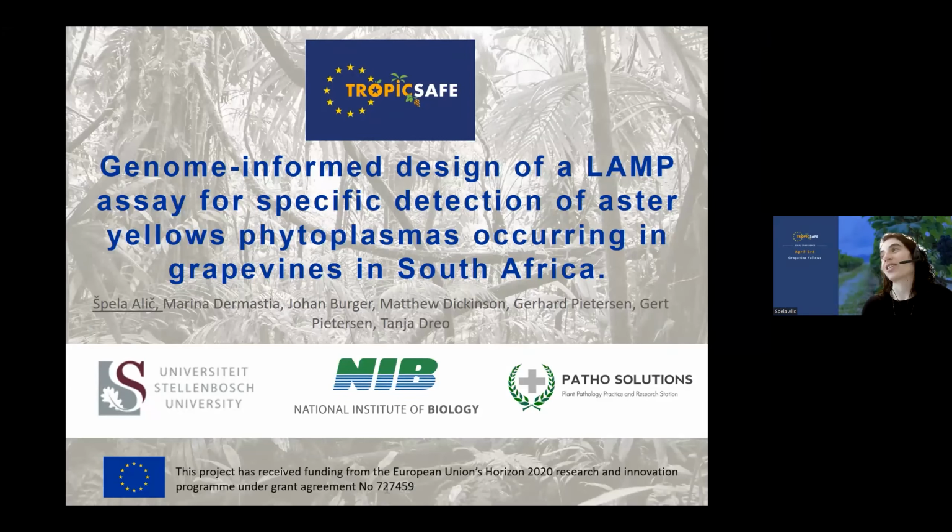As Asunta mentioned, yes, I will present our work on design of a LAMP assay for a specific detection of aster yellows phytoplasma from South Africa.